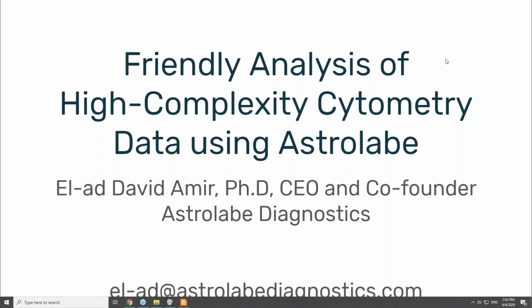Great, thank you, Elad, for your presentation. Let's get over to the questions. This one's got a comment at the beginning. It's very nice to have all the subsets labeled, but what if we are doing biomarker discovery and there's something we don't know the identity of? What do you recommend for those users?